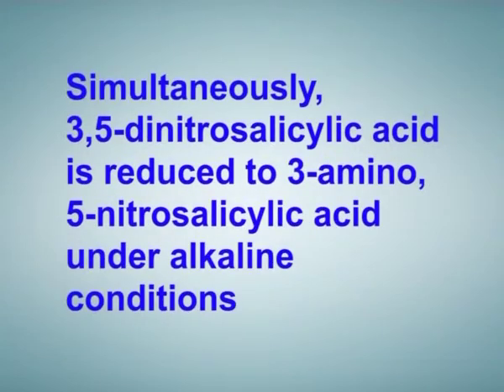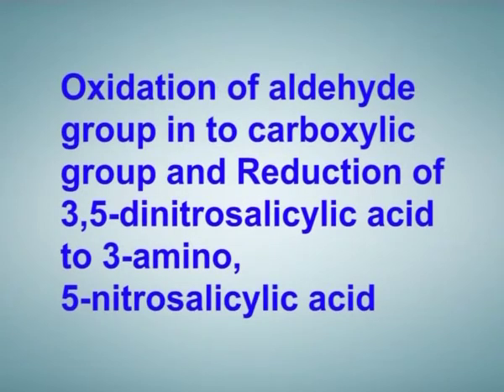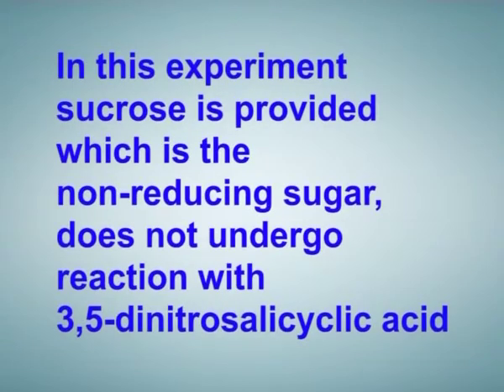Simultaneously, 3,5-dinitrosalicylic acid is reduced to 3-amino-5-nitrosalicylic acid under alkaline conditions. Oxidation of the aldehyde group into a carboxylic group and reduction of 3,5-dinitrosalicylic acid to 3-amino-5-nitrosalicylic acid. In this experiment, sucrose is provided, which is a non-reducing sugar and does not undergo reaction with the 3,5-dinitrosalicylic acid.